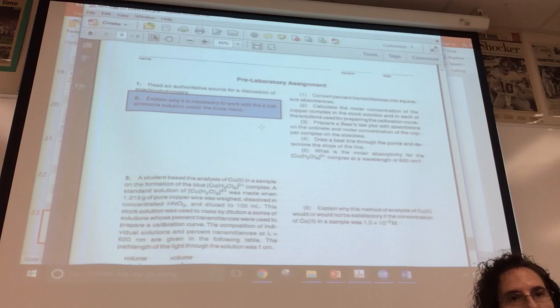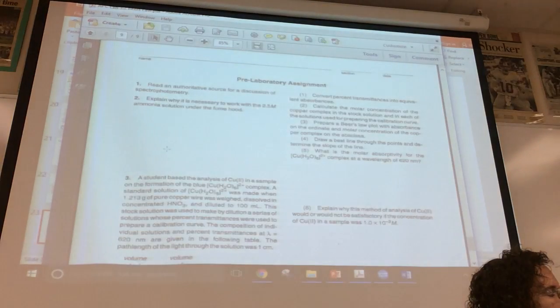So the ammonia is highly volatile, so it readily goes from the liquid to the gaseous phase, and as a result, for safety reasons, you would want to open it up in the fume hood. And this probably is more concentrated than the bottle you have at home, although it comes up to 4 molar, so I don't think this is too bad.